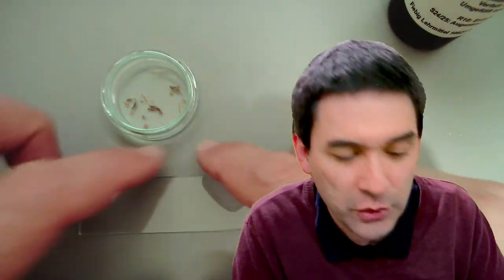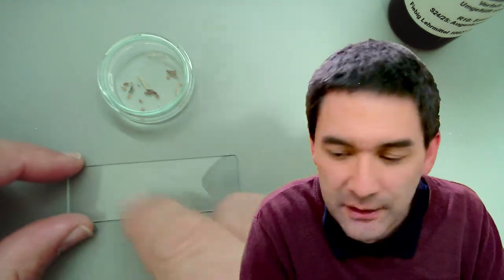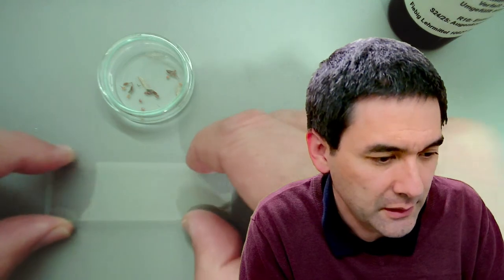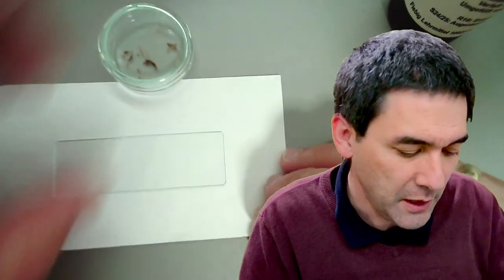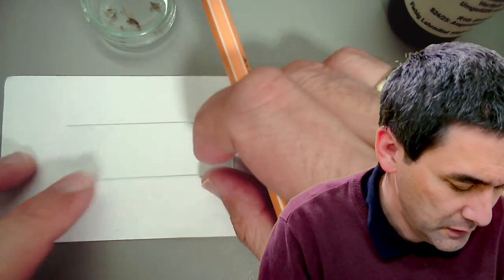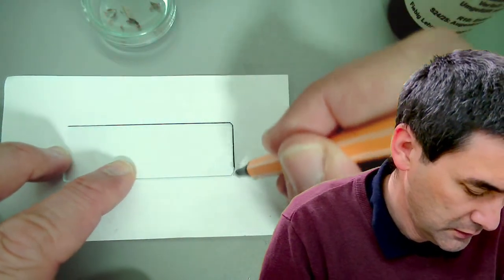Okay, and I forgot, I wanted to do something. Actually, normally what I do is I put a piece of paper beneath it, and then I mark the center. So basically I put it on the paper, and then I mark the center. You know what? I could do it here as well. So that I get uniform slides, but actually it's not a bad idea. Why not do it live? So you'll see the point of this right away.